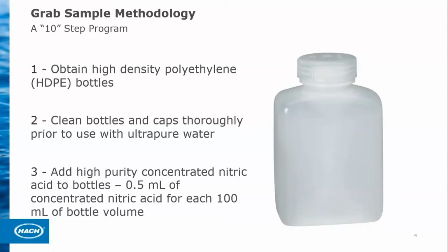So first of all, using the correct bottles. HDPE is probably the best to use. It's not the only material, but it's really preferred for using grab sample with ultra pure water. You need to properly clean the bottles and caps, and the best way to do that is with ultra pure water.